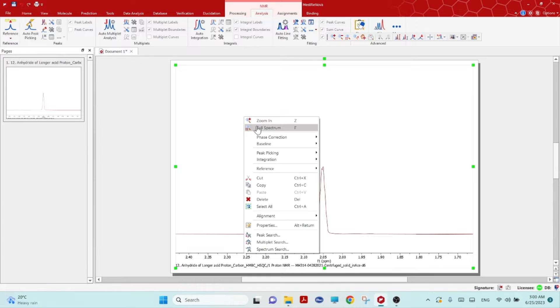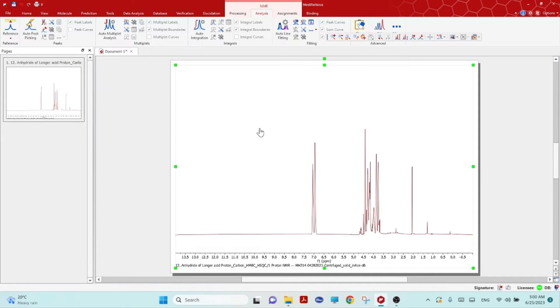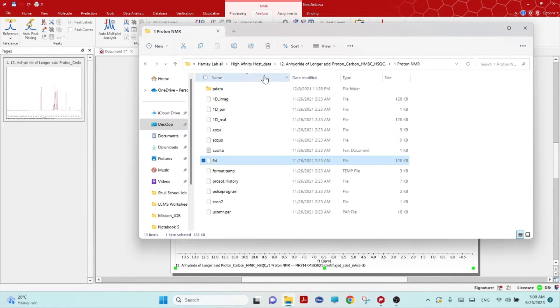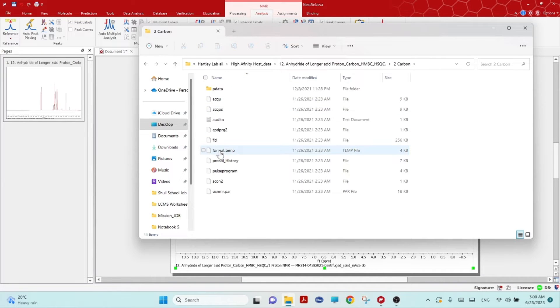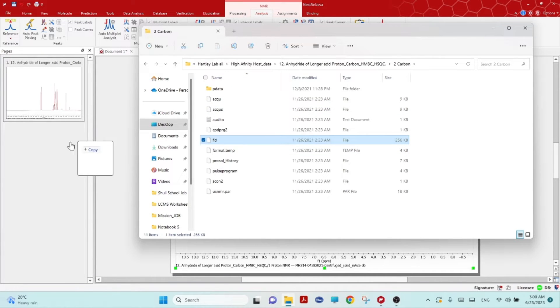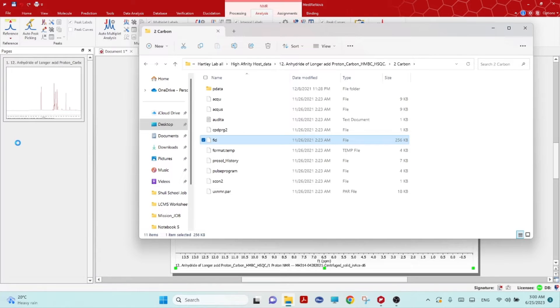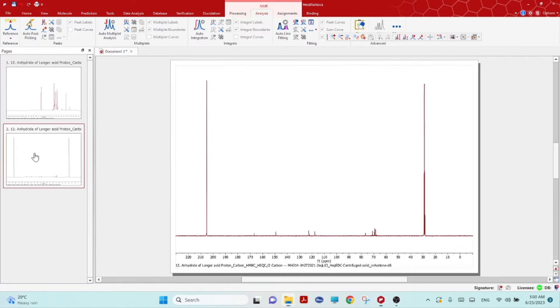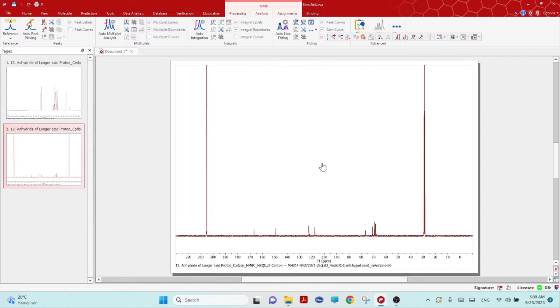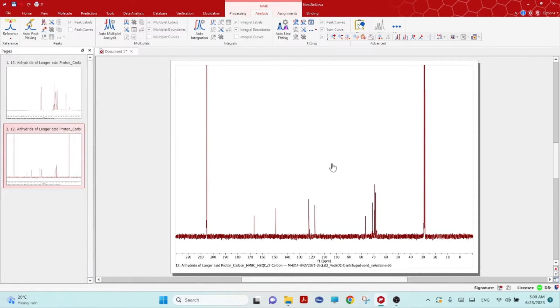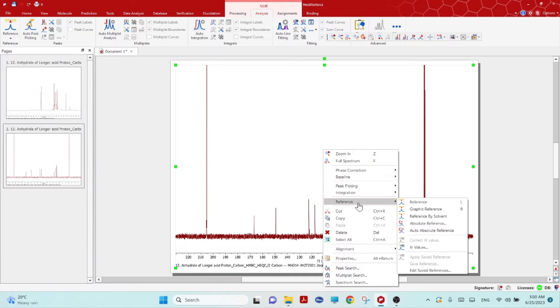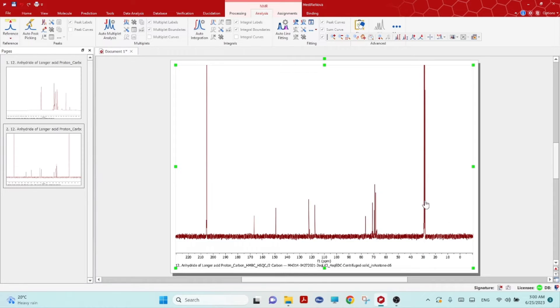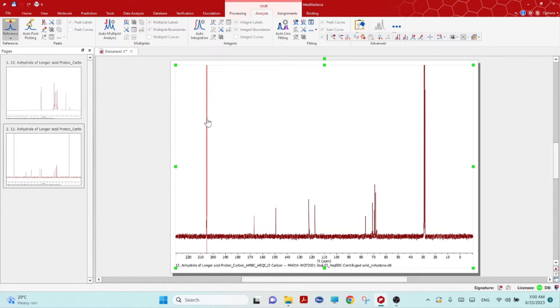Then right mouse click again, full screen, and then now open the carbon NMR, 1D carbon NMR of the same compound. Same as before, drag the FID file here and just make it bigger.